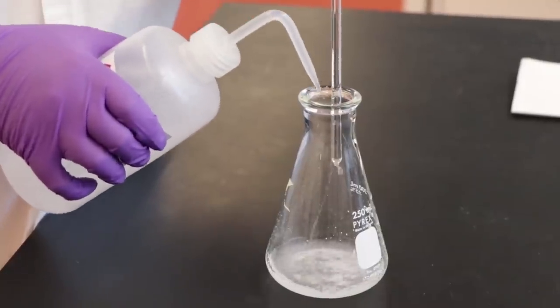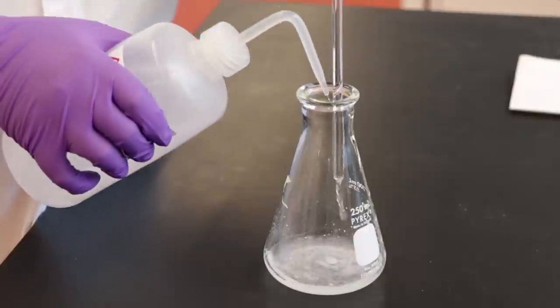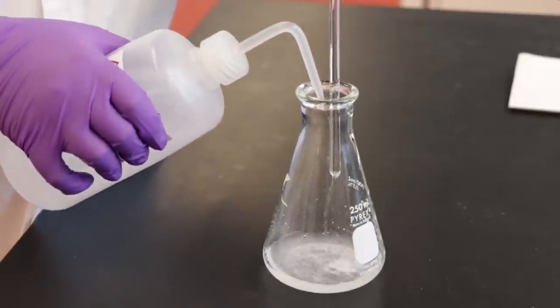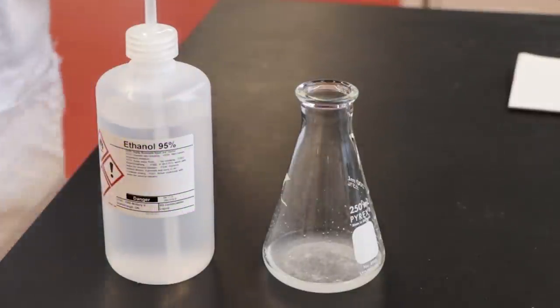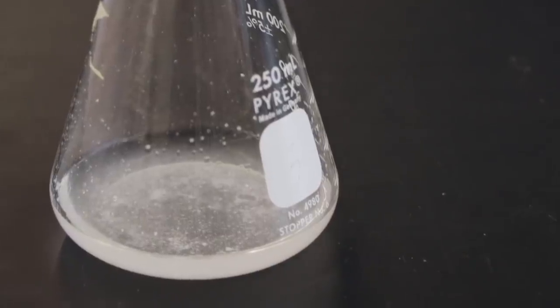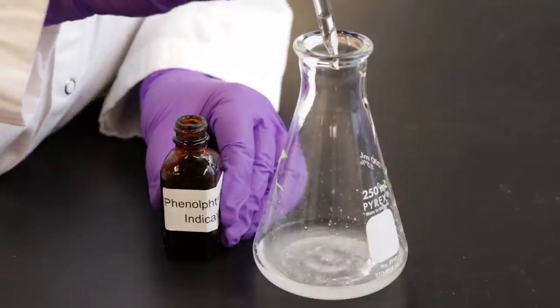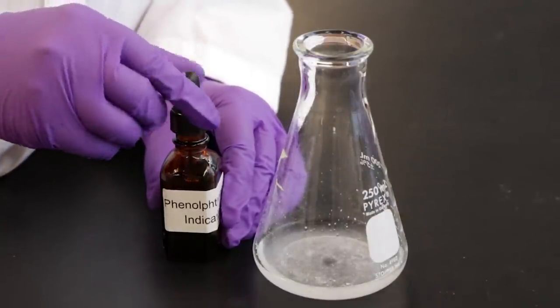Remember to rinse the glass rod with a small amount of 95% ethanol before removing it from the flask. Some of the binding material from the tablet will not dissolve, but there should be no large chunks remaining in the mixture. Then add two drops of phenolphthalein indicator to the flask.